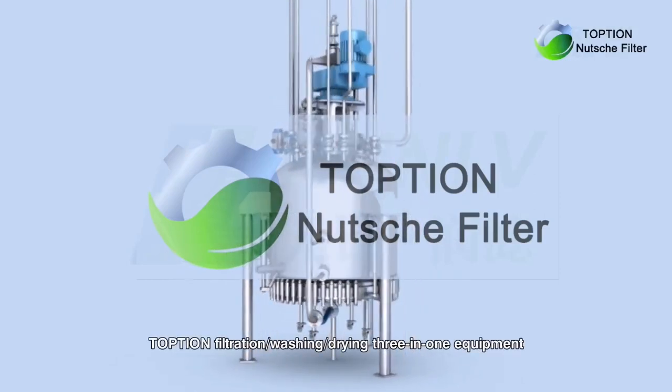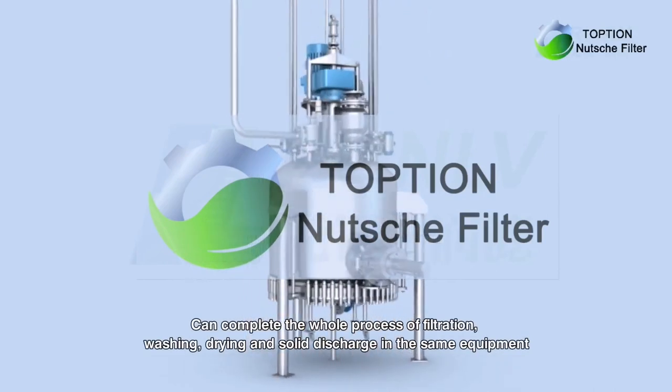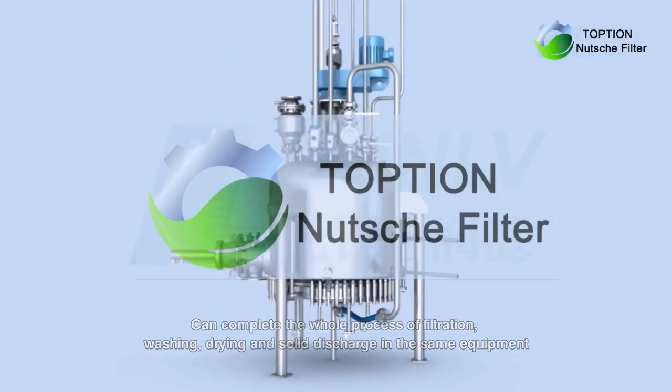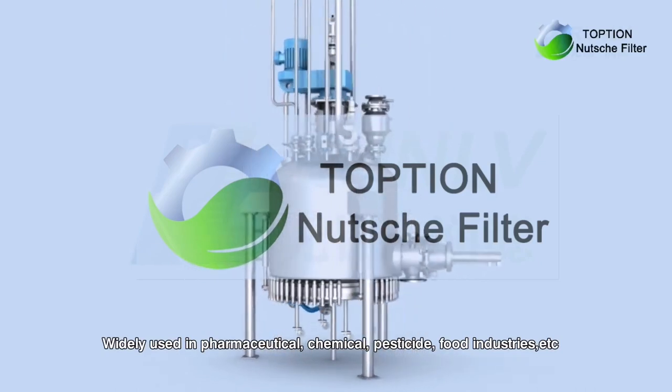TOPTION Filtration Washing Drying 3-in-1 Equipment can complete the whole process of filtration, washing, drying and solid discharge in the same equipment, widely used in pharmaceutical, chemical, pesticide, and food industries.